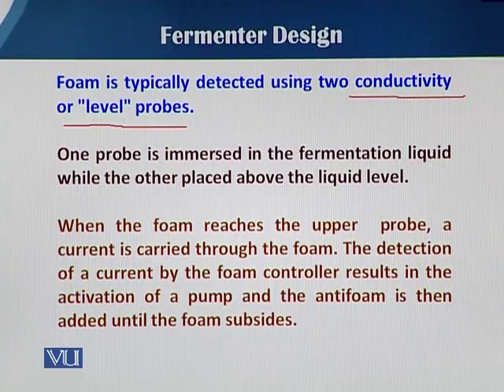So these are basically two conductivity or level probes. One probe is immersed in the fermentation liquid, while the other one is placed above the liquid medium.